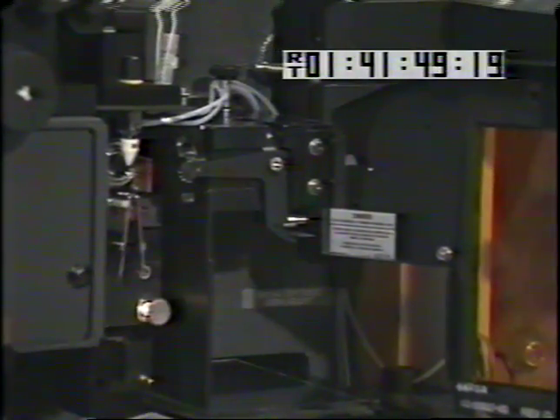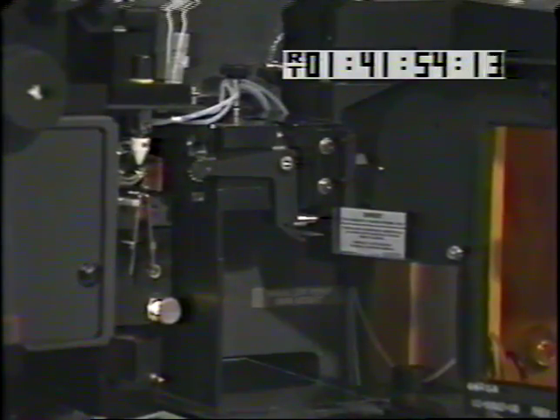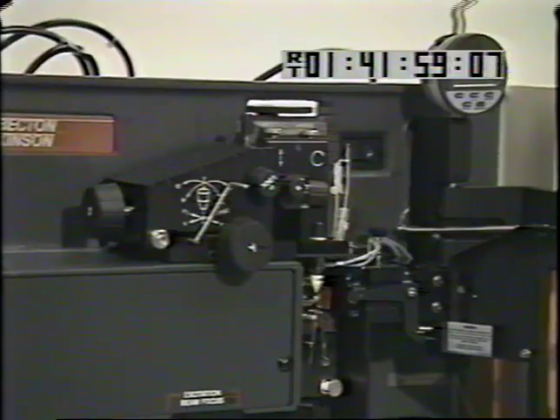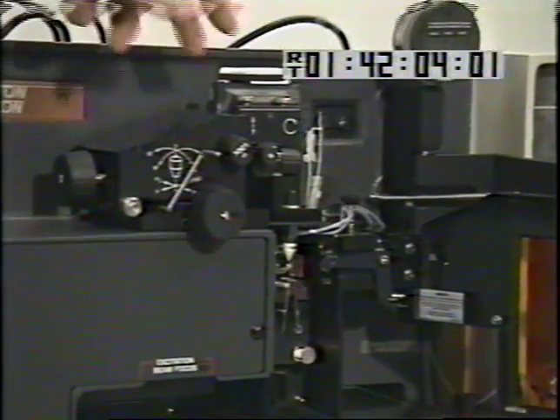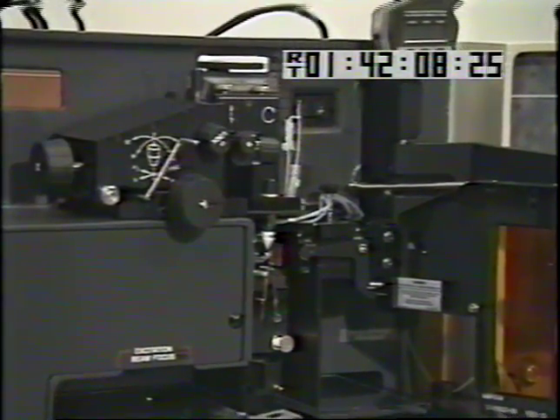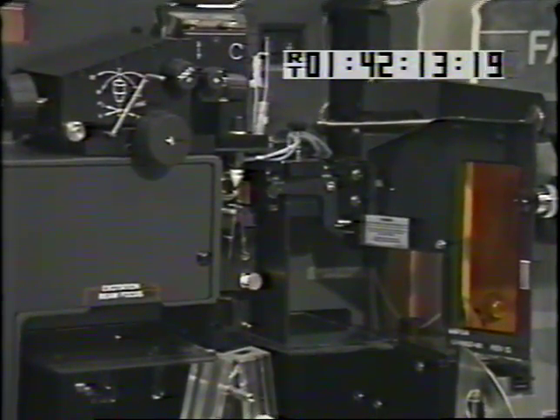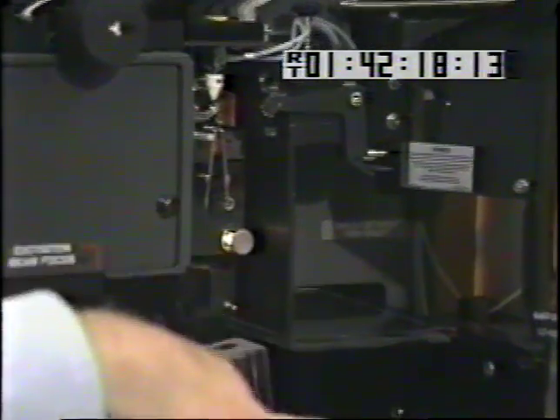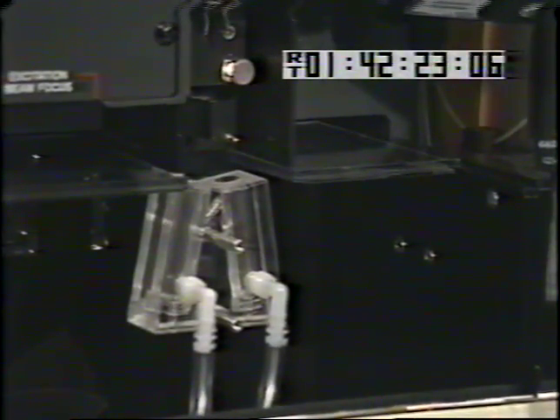We adjust the mechanics such that the laser beam is aligned for our forward scatter measurements and for our fluorescent channel side scatter measurements. Once that setting has been achieved, we then position and adjust the drive nozzle such that the droplets passed down through the laser beam can be positioned and the elements collected in the catcher tubes at the base of the cell system.